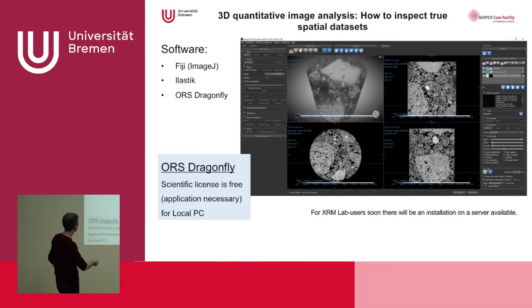And also a more complex imaging suite here is the ORS Dragonfly, and that's a cool thing because you can apply for a scientific license, and then it's free of use. It's a huge and very capable software.